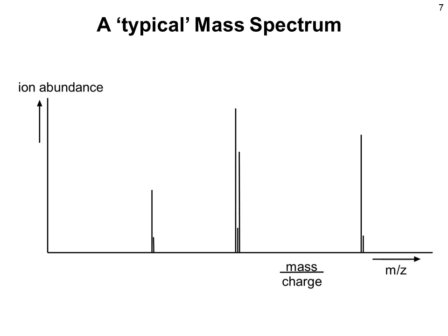Here you see a typical mass spectrum, actually a schematic of a mass spectrum. Let's look at the axes. The x-axis shows the mass-to-charge ratio, m/z. The y-axis shows the ion abundance, or sometimes called the total ion current. In this spectrum we see different peaks which are non-assigned in this case. These could be three different molecules with different mass-to-charge ratios, but it could also be fragments of the same molecule, a molecule that broke, for example, during the ionization process.